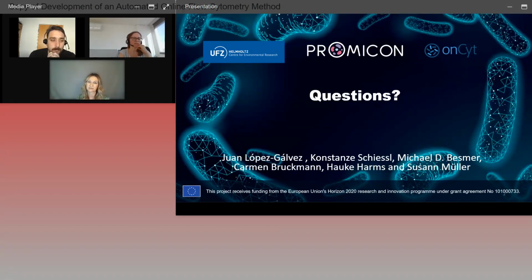But maybe from the sample side, I think that would be with Juan. We intend to use our new procedure as a sensor of bacterial communities that grow in a bioreactor. This new procedure gives real-time information, and we plan to use this in biotechnological procedures that use bacterial communities as main producers. So we are right now doing tests with these bioreactors and trying to expand the capabilities of this procedure.